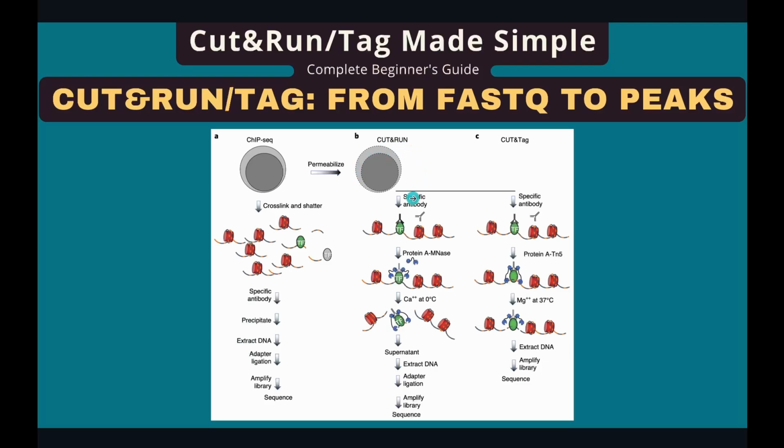They start with live cells. In CUT&RUN, the first step is antibody binding to the protein of interest. Next, an enzyme called PA-MNase binds to the antibody. Upon activation by calcium ions, this enzyme can precisely cut the flanking regions of the protein binding sites. These regions are then subjected to sequencing.